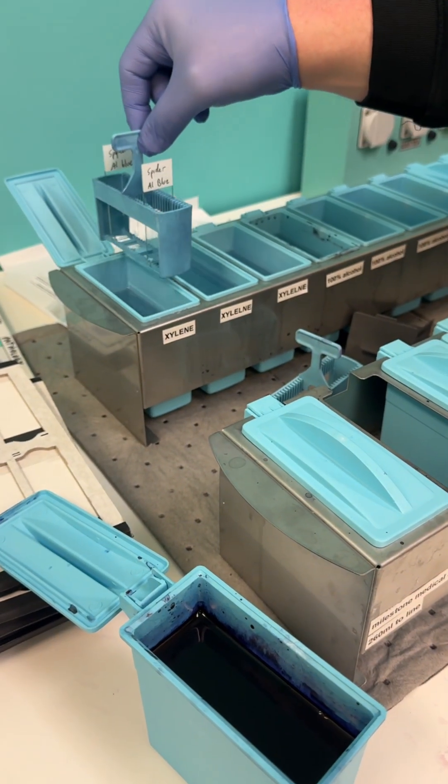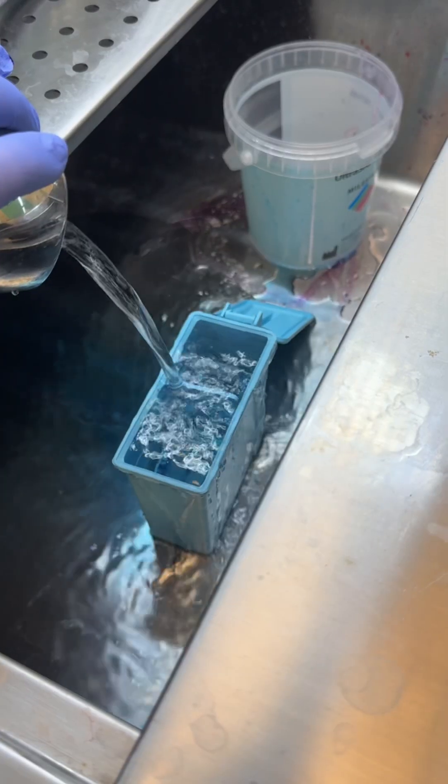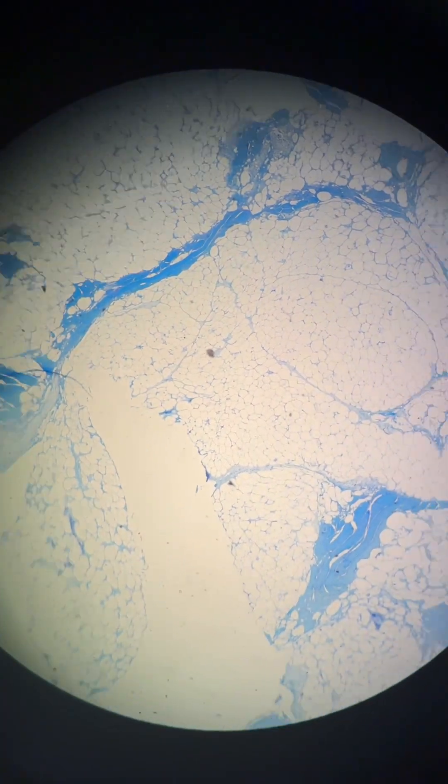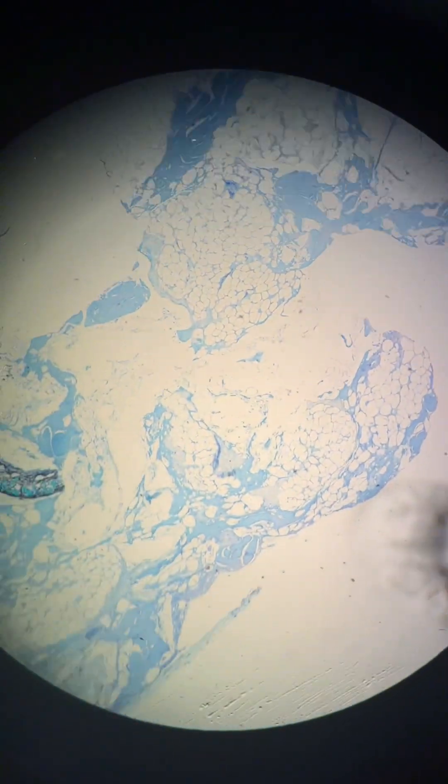Next, we stained the sausage with toluidine blue and H&E stains. Here's what the sausage looks like under the microscope. It's pretty interesting, right? Can you see the different tissue types? Let us know your thoughts in the comments.